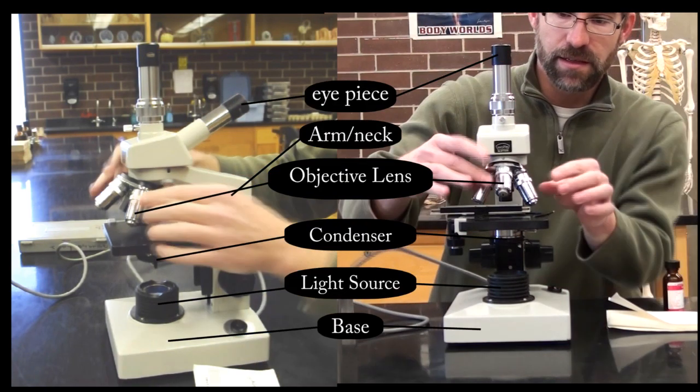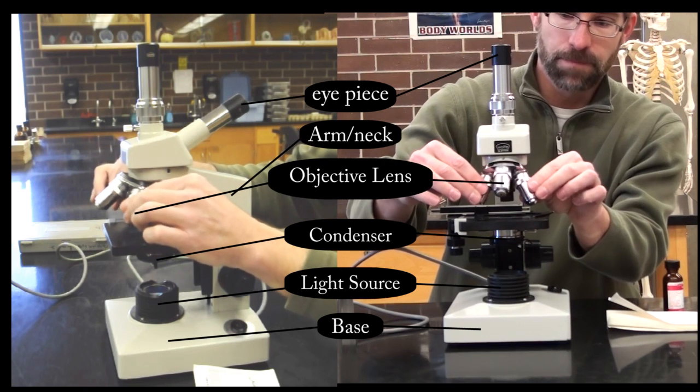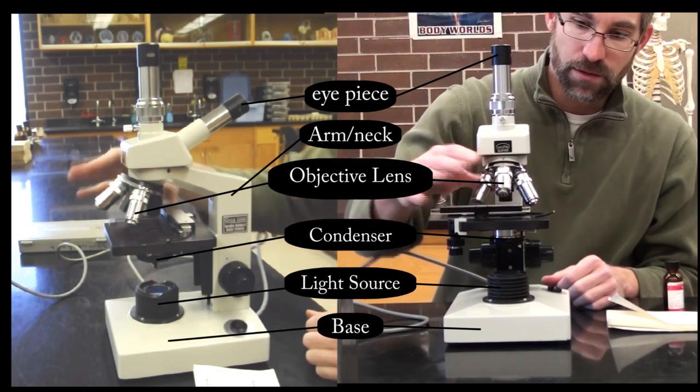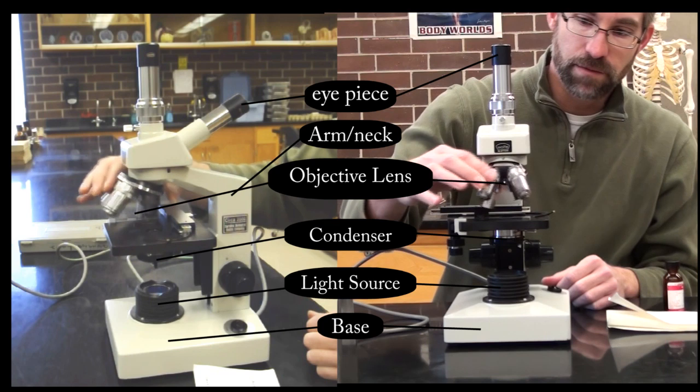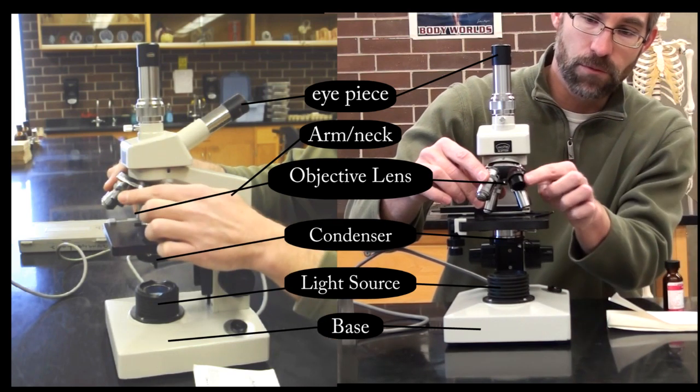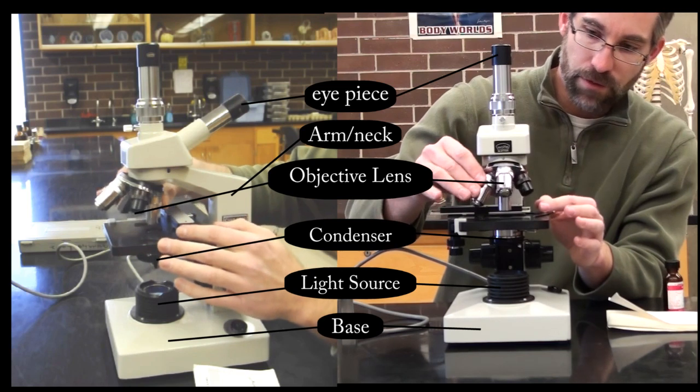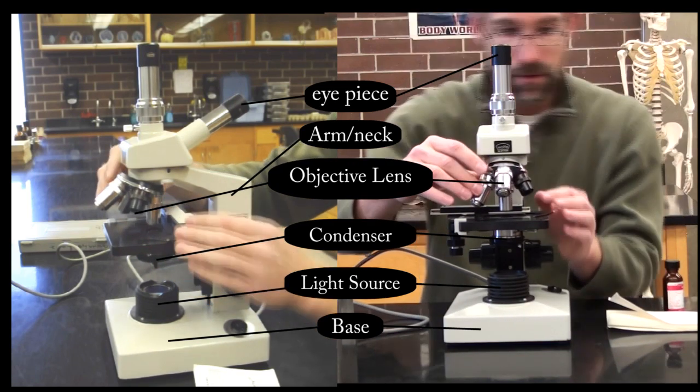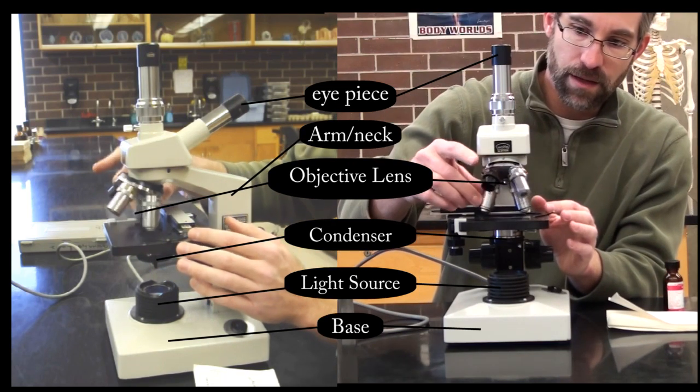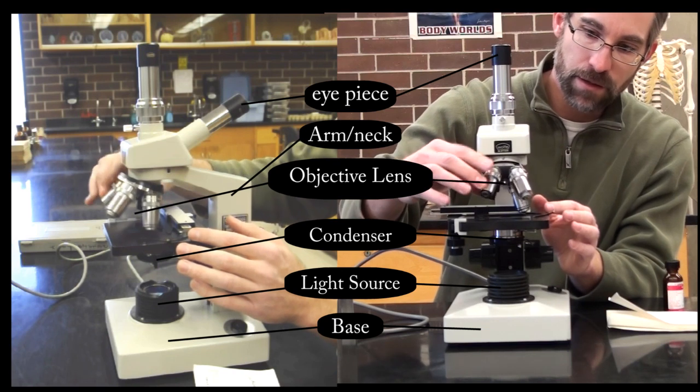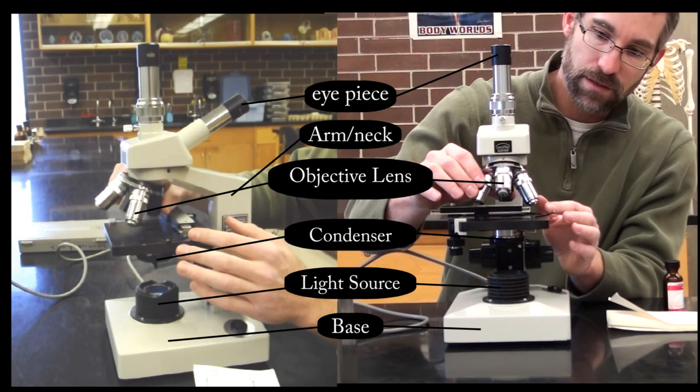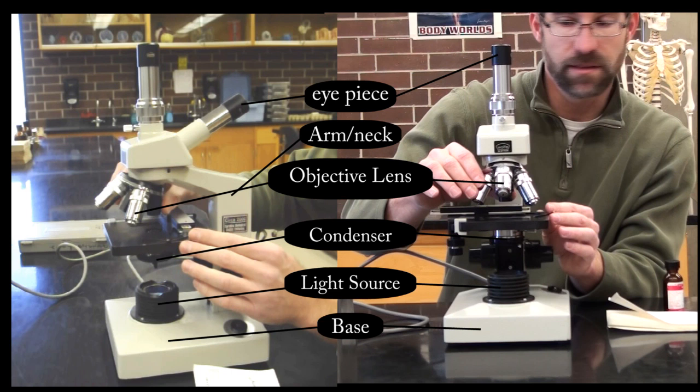In terms of lenses, these are our objective lenses. Best practice is to always start on the smallest objective, which is this one right here. This is 4 power. And then as we rotate through, we will have a total of four different objectives. We can rotate the headpiece and there's a small click that should occur to make sure the lens is in appropriately.